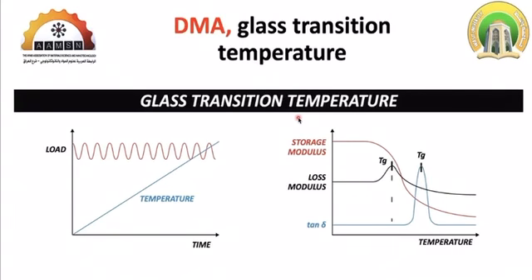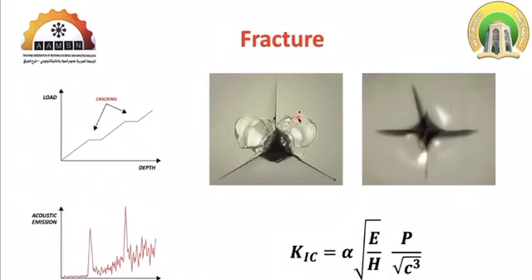And this, after comparison with other thermal testing, has been found very accurate, because under nanoindentation we are testing the mechanical property, as we mentioned earlier, with very high accuracy, and all these transitions are related to degradation in the mechanical properties. So we can also detect this degradation in the mechanical properties by using nanoindentation.